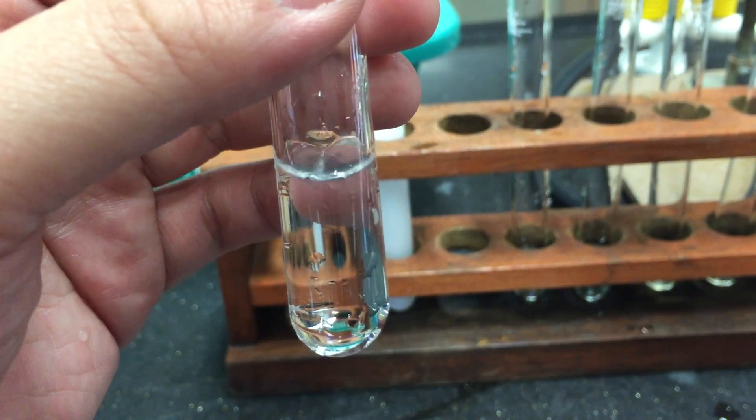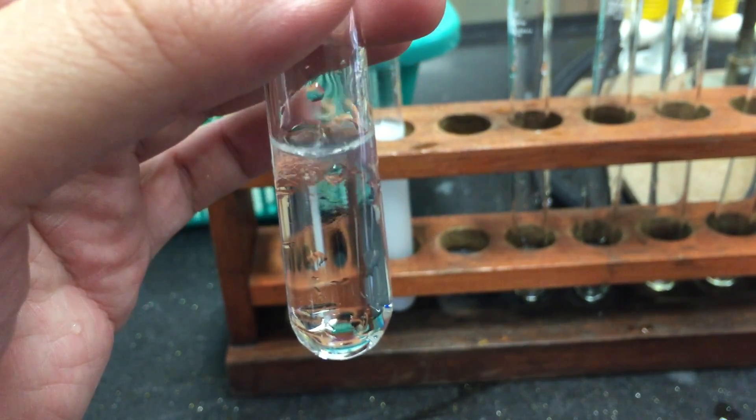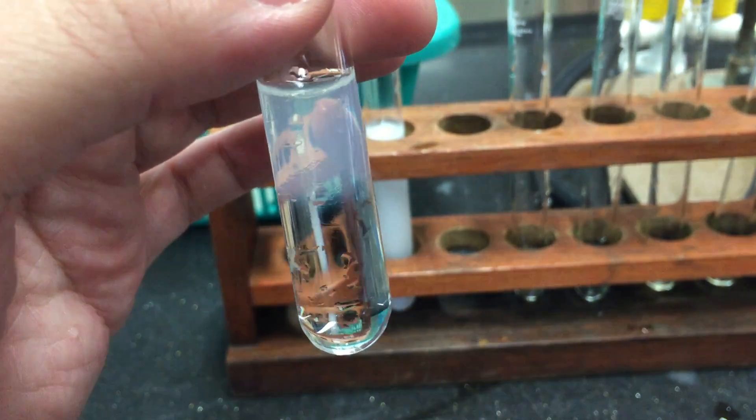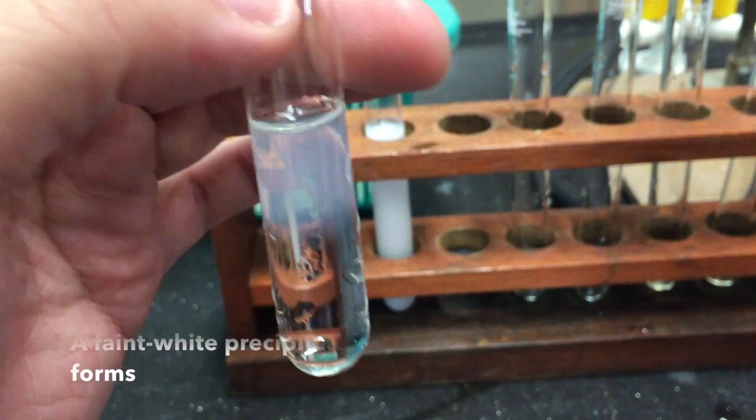Let us now repeat the experiment without disturbing the test tube too much. When a few drops of ammonia solution is added, notice that a faint white precipitate actually forms.